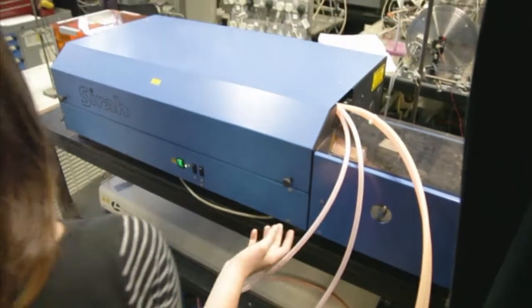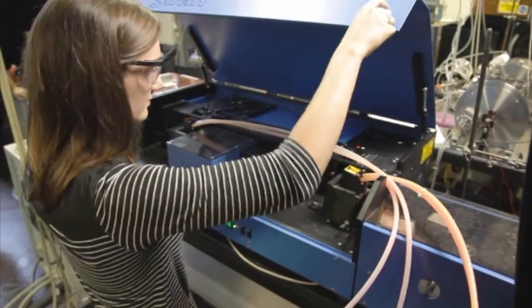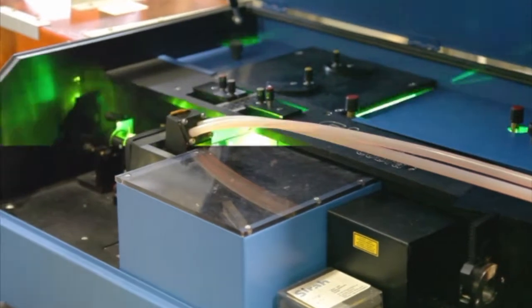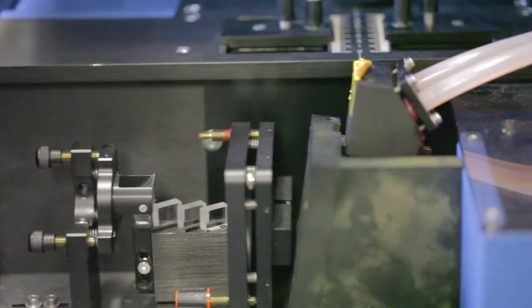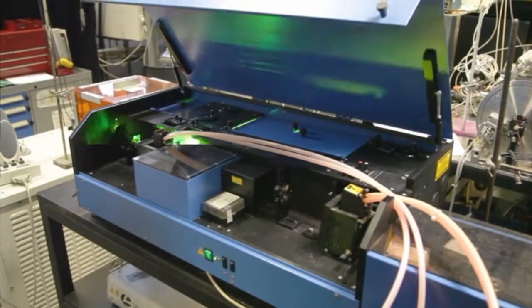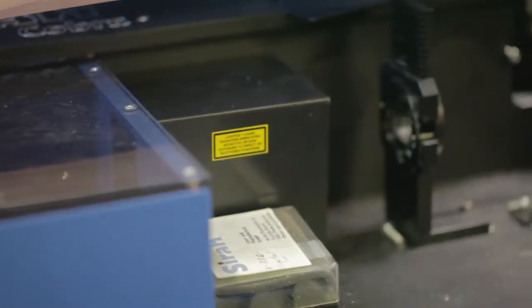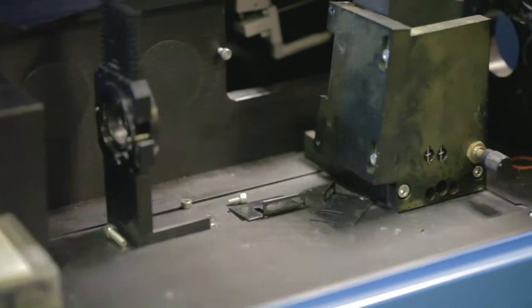So if we take a look inside, you can see that there's two cuvettes of the dye, which is here and here, and that's where the initial YAG light excites the dye and then that produces the required wavelength of light that we're after. And then at this stage here, just before it goes into the turning mirror, it goes through a frequency doubling crystal, which then turns the light to 282 nanometers, and that's the light that we use to probe the OH radical.